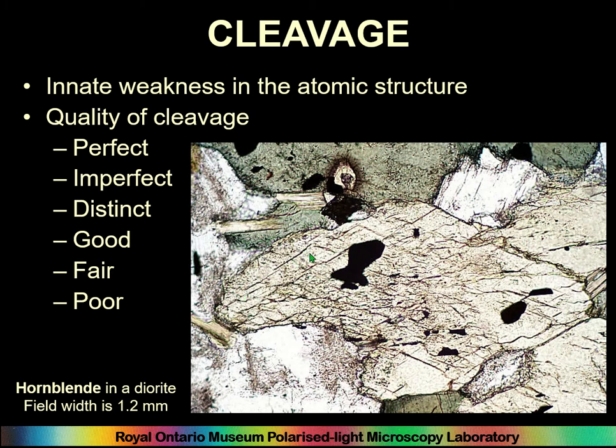It might not be. But one thing you want to look out for is parallel lines. Then you know that this structure goes all the way across the mineral. And here, of course, you can see other ones going this way. So if I saw this, I could quickly say, oh, that's an amphibole of some sort. And then I'd want to figure out which type of amphibole it is, if I can. Quite often, it might be better just to say, this is from the amphibole group.